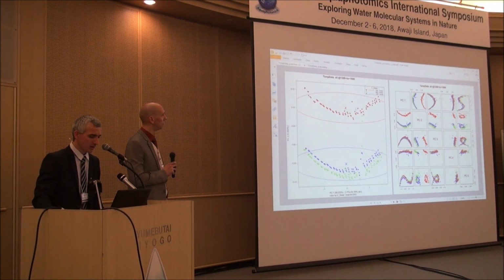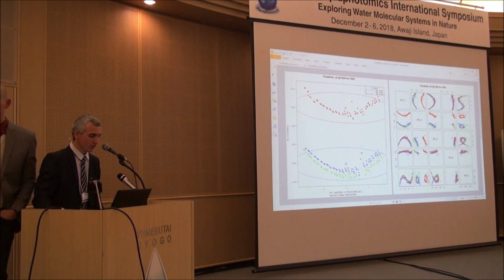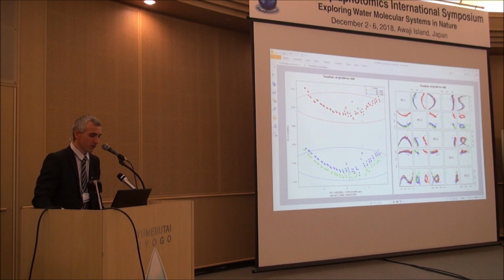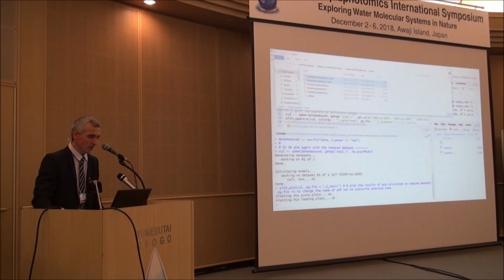Now we can see the scores of air disappear, and instead we can see the scores of the waters colored by, in this case, the sample name, the water name. And of course, in the analysis procedure, you can list all the different class variables you want to use for coloring. So in these first 2 pages, you can see the scores colored by the water type, then colored by temperature, then colored by consecutives or whatever you want.